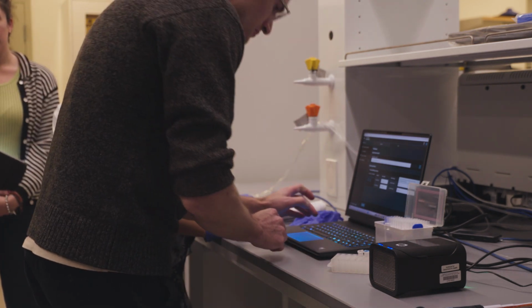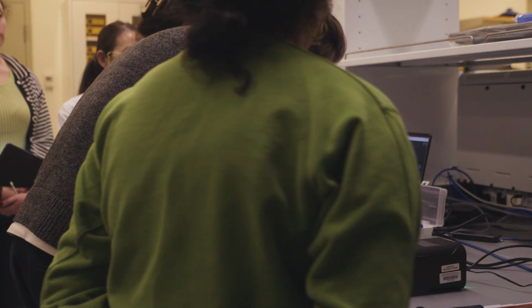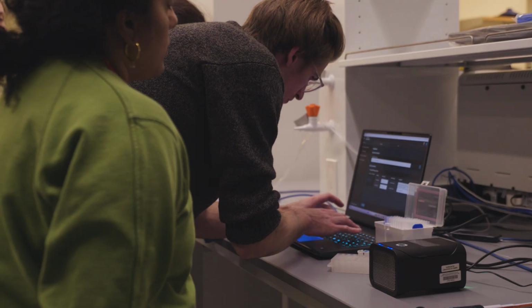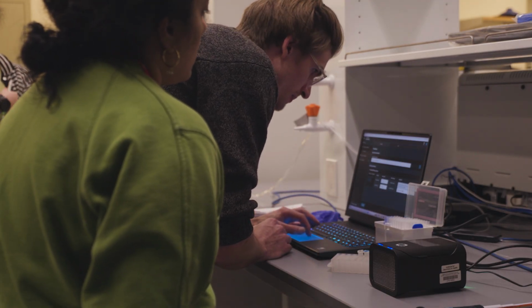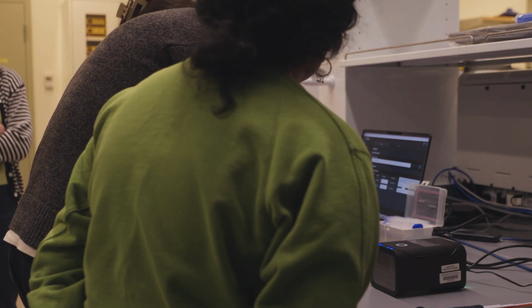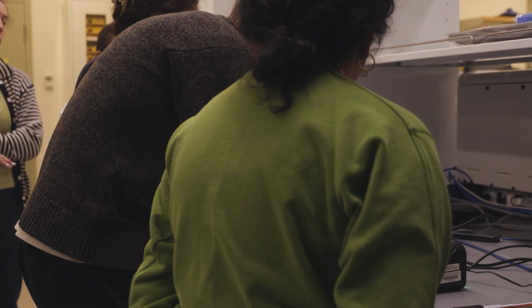And plasma 4 to 6. And I guess they were all A. In the barcode plate, we started first in column A1, so A1, A2, A3, A4, A5, A6, rather than going across.